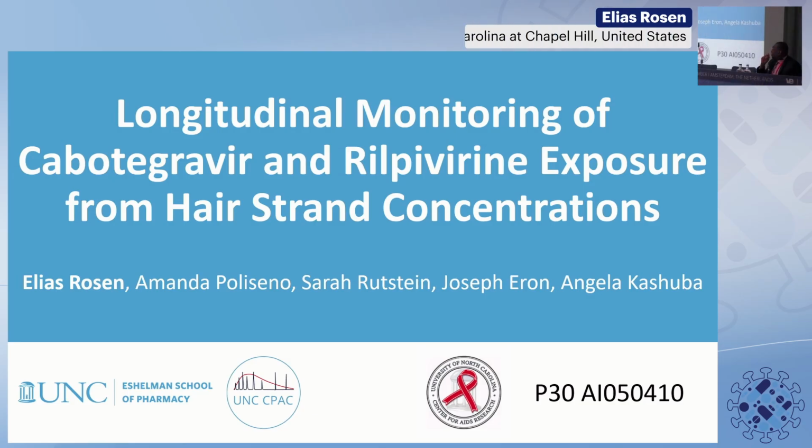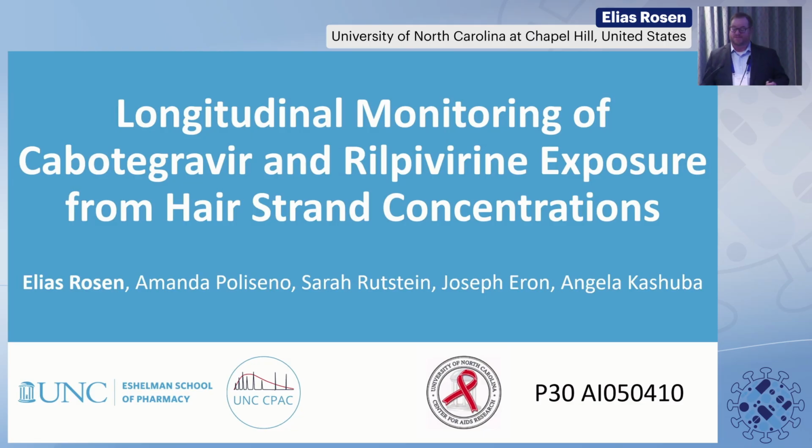Afternoon, everyone. Thank you to the organizers for the opportunity and for the introduction this morning by Keith to this technique of mass spectrometry imaging that we use, primarily for analysis of the penetration of antiretroviral drugs into key reservoir tissues, but the other domain that I'll talk about this afternoon focuses on looking at the disposition of those drugs in hair strands.